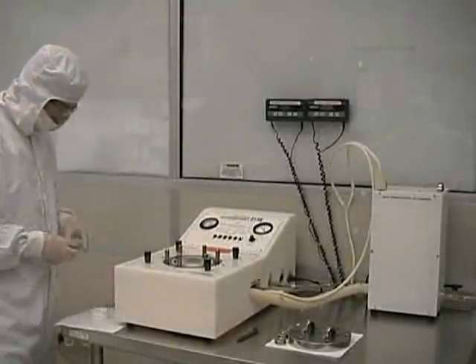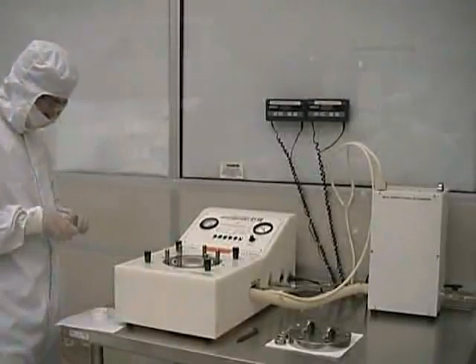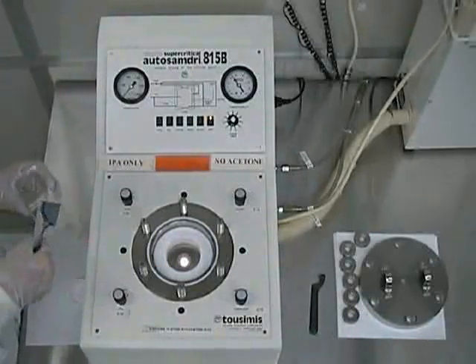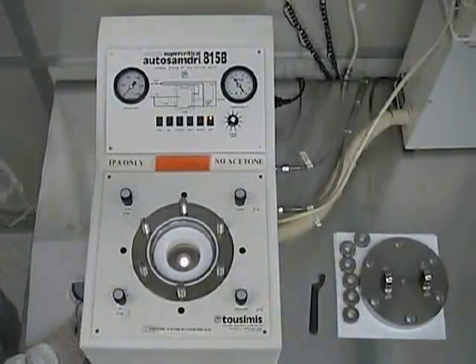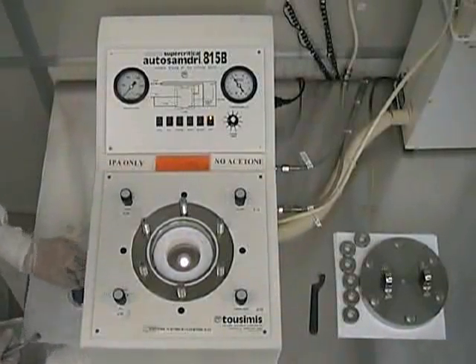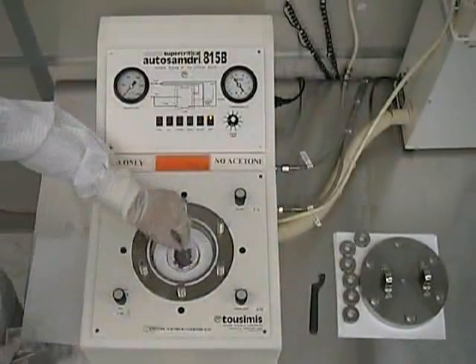First, place a spacer ring on the bottom of the wafer holder before putting in your wafer. For the best results, you should minimize the amount of time the wafers are exposed to air. Once the process chamber has been properly sized for your wafer type and your sample has been loaded into the correct sample holder, you should then place it in the process chamber.